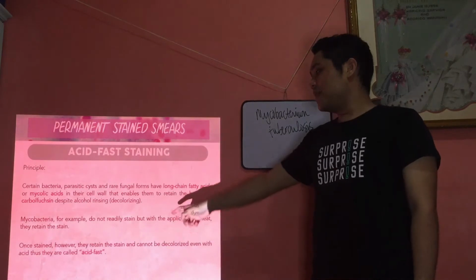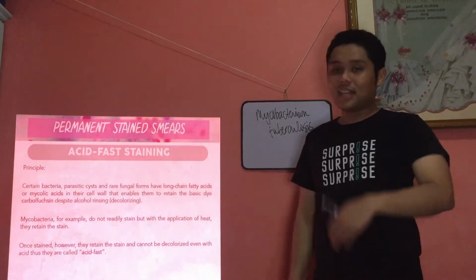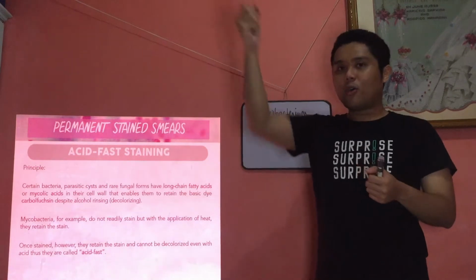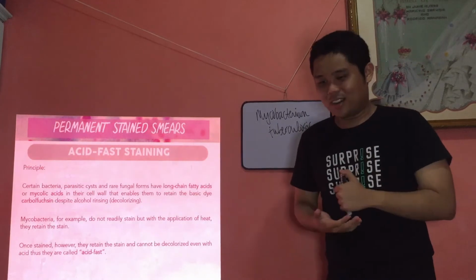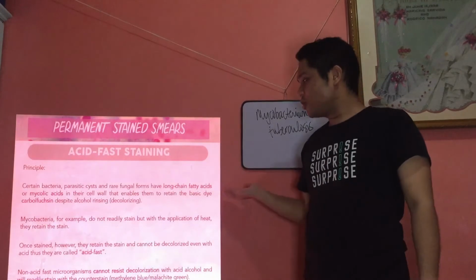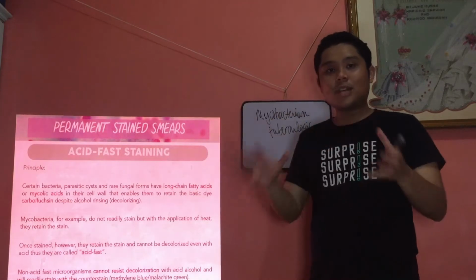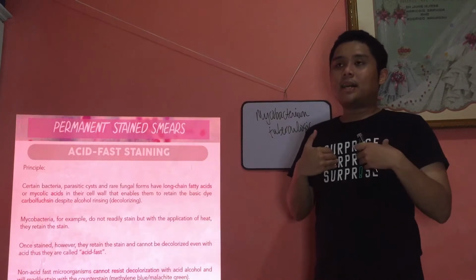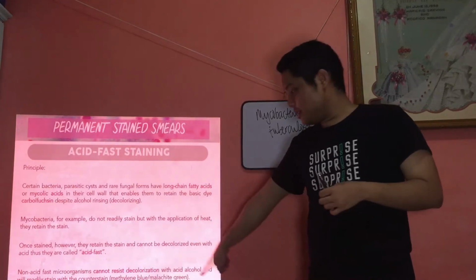Once stained, they retain that stain and cannot be decolorized even with the acid. Thus, they are called acid fast, meaning they quickly resist and retain the carbolfuchsin. Lastly, non-acid fast organisms, those without long-chain fatty acids in their cell walls, will not retain carbolfuchsin, but they will take up the secondary stain or counterstain, which can be either malachite green or methylene blue.